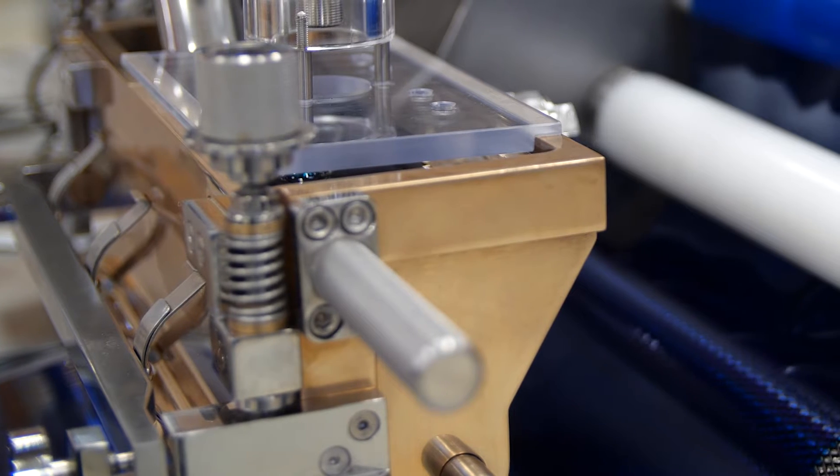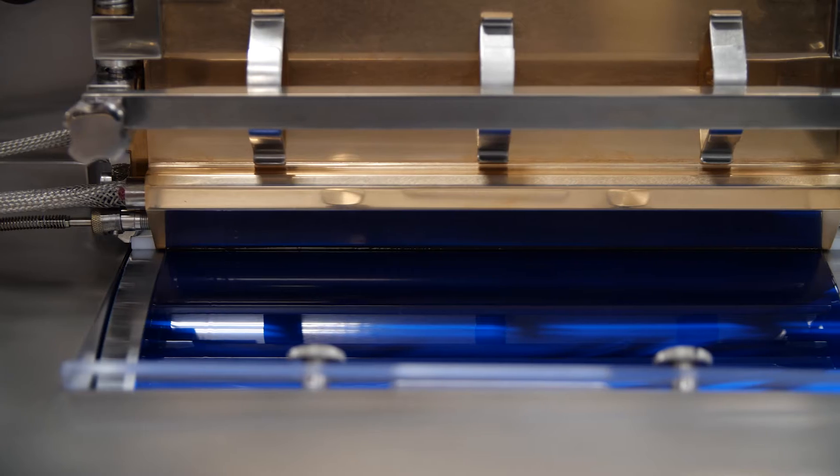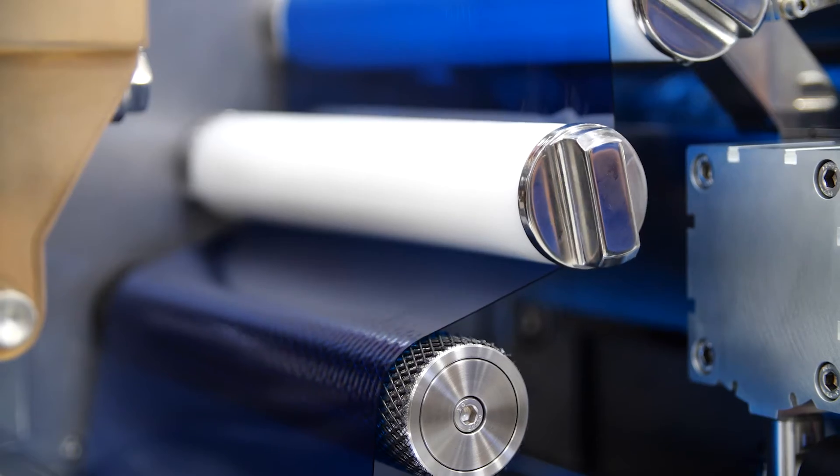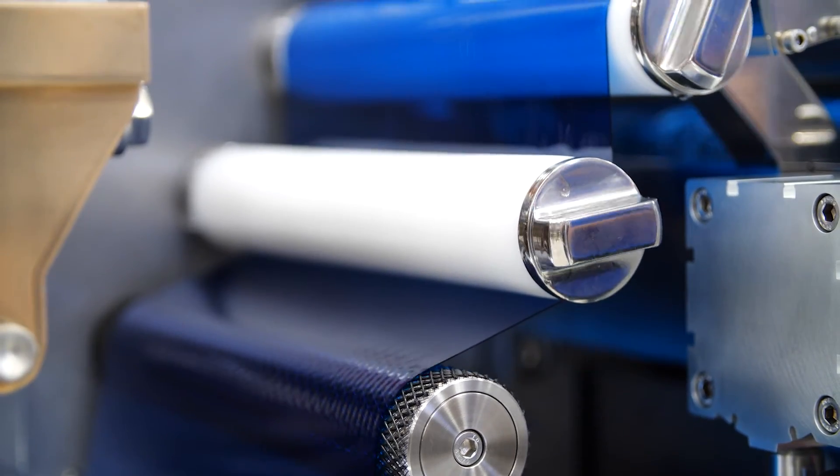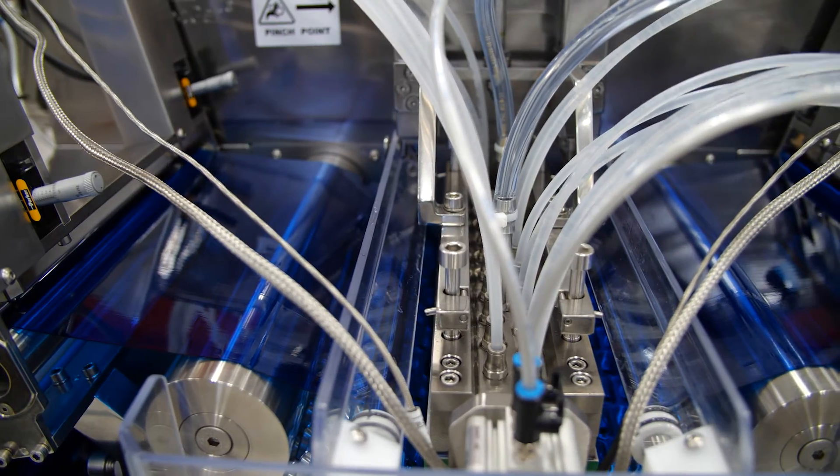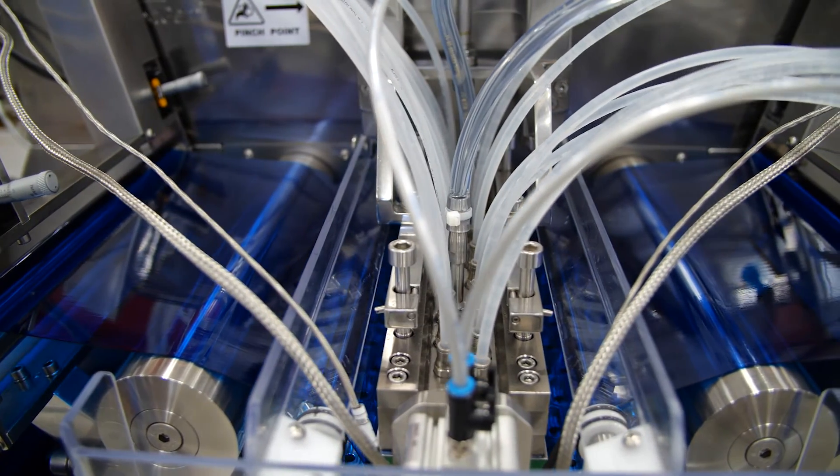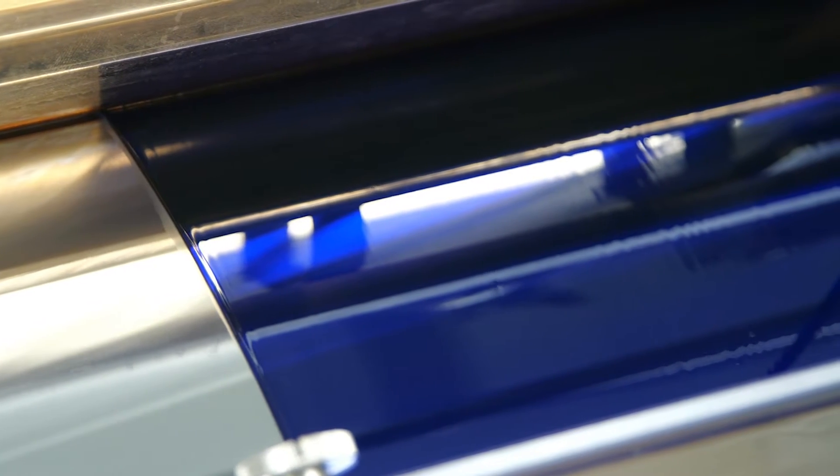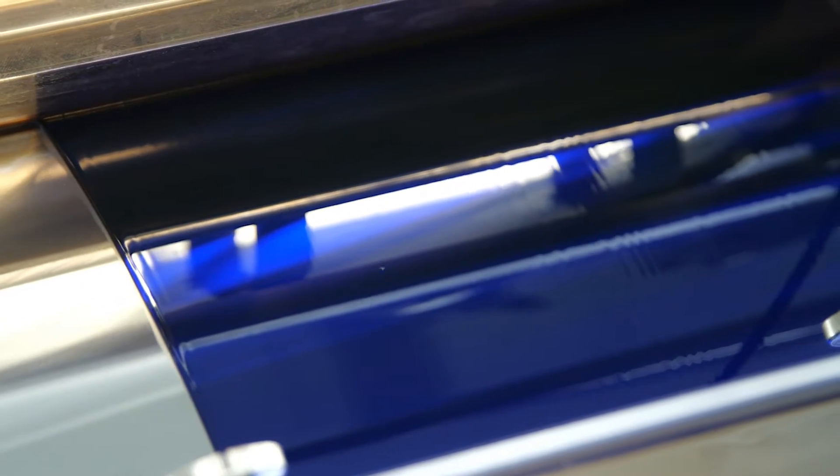The gelatin fills two spreader boxes and is spread over the surfaces of two rotating casting drums at a thickness that can be adjusted according to product specifications. The gelatin has now formed a roughly 12-inch wide ribbon, which keeps its new form with the help of cooled air flowing over the upper surfaces of the ribbons, and with chilled water to cool the casting drums in contact with the lower surfaces of the ribbons.